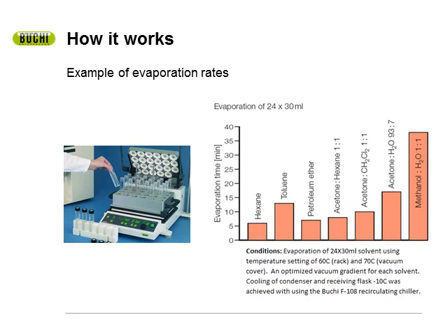Now you've got to consider 15 milliliters of that is H2O. Everybody knows that water is very hard to evaporate off because of the hydrogen bonding that's going on. And the boiling point's fairly high. It's at 100 degrees Celsius. And we're still able to do that at a very attractive time.